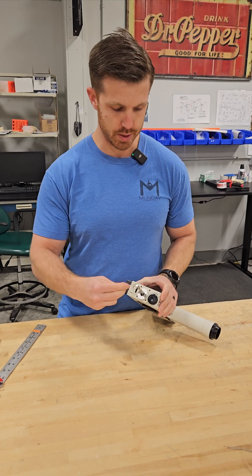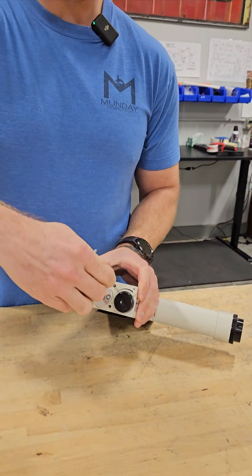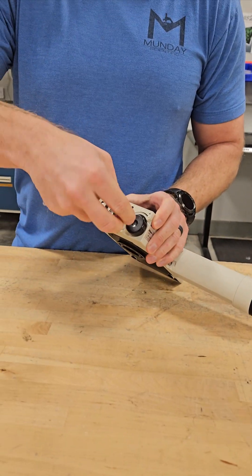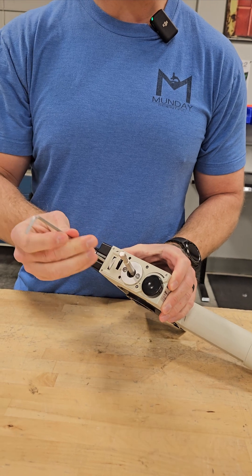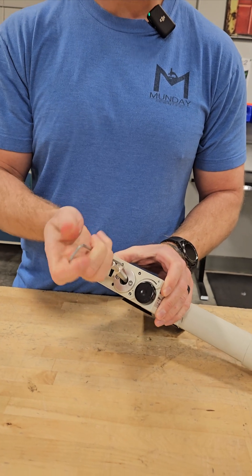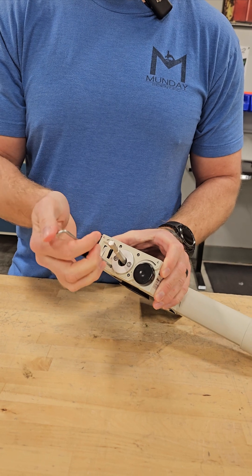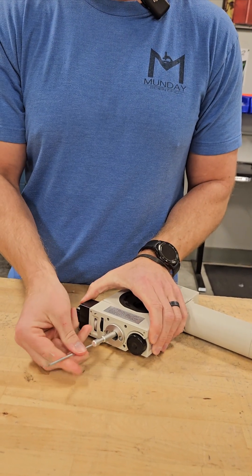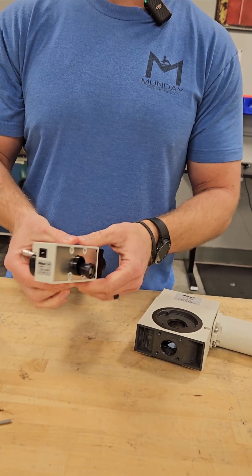You're going to take a three millimeter allen wrench. Right here on the front of the unit there are four holes. The screws won't fall out, so just loosen the screws within the holes and that unit will come out.